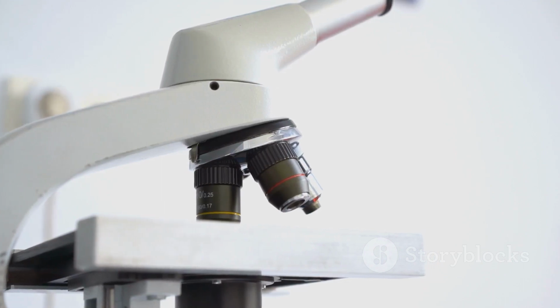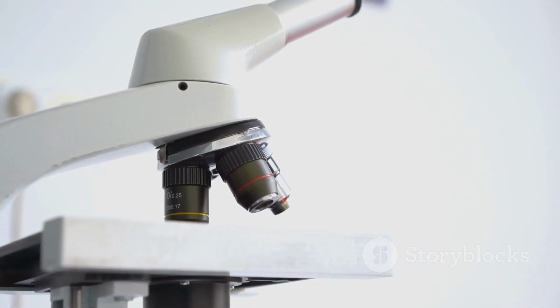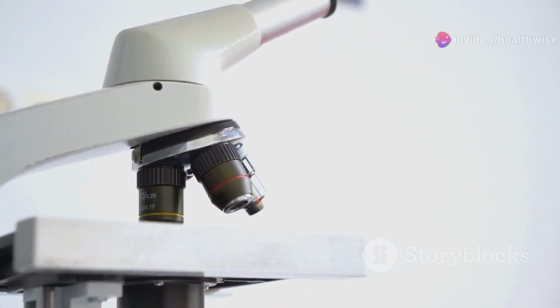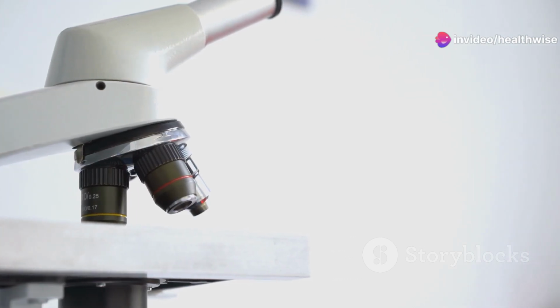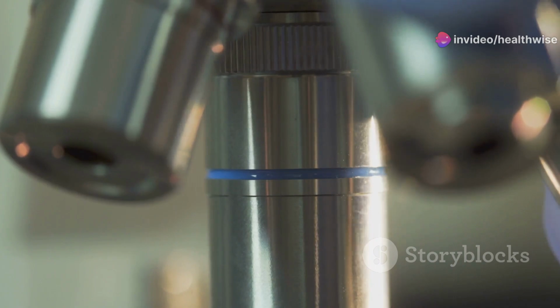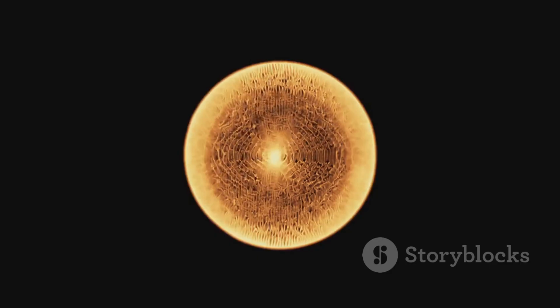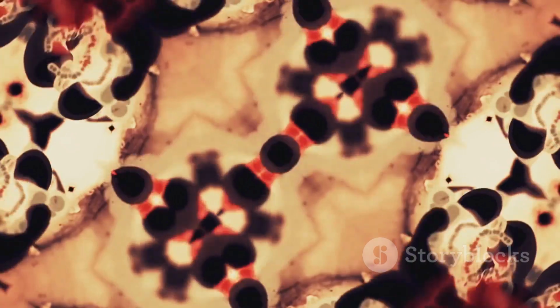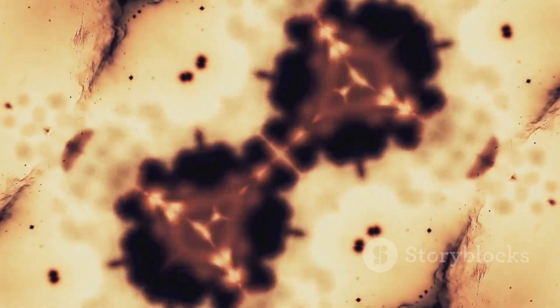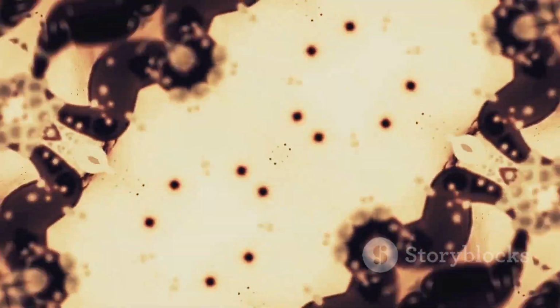There are two main types of electron microscopes: transmission electron microscopes, or TEM, and scanning electron microscopes, or SEM. Each provides a unique perspective on the nanoscale world. Electron microscopy has revolutionized our understanding of the ultra-small. It has revealed the intricate machinery within cells, the structure of viruses, and even the arrangement of atoms in materials.